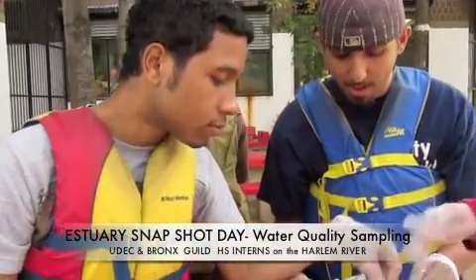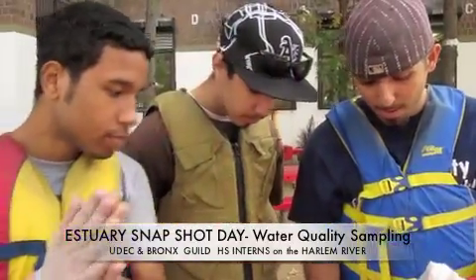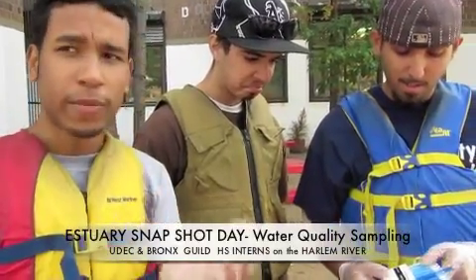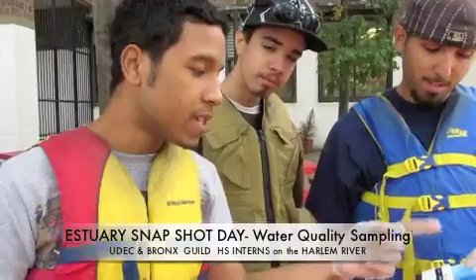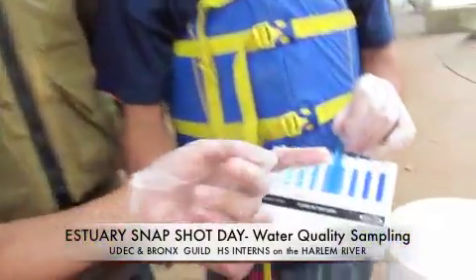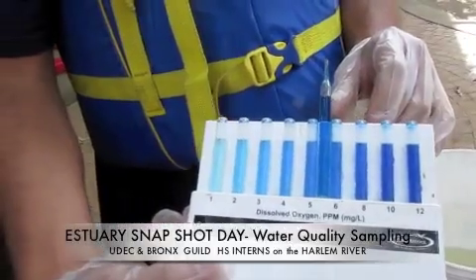So what have you found? Yeah, it's 5.5, I guess. It's between 5 and 6. Tell me what you've done. I've compared the different two colors to the one from the water that we collected in the Harlem River.